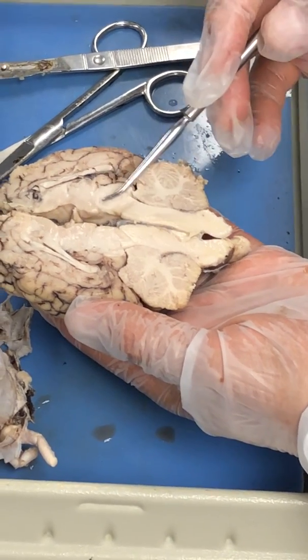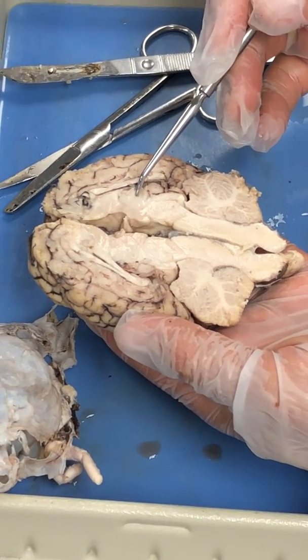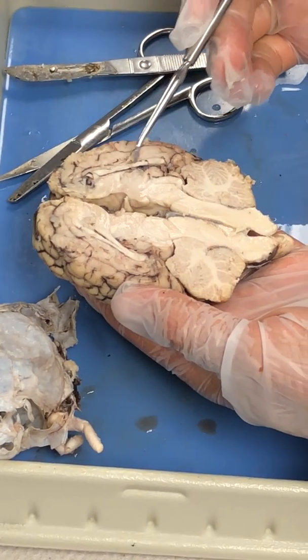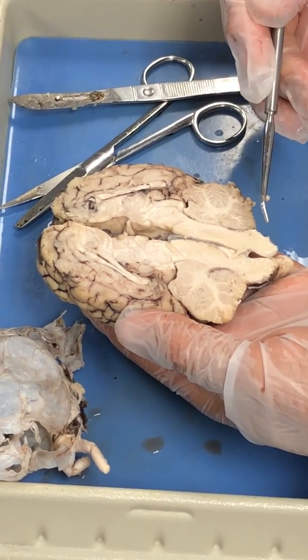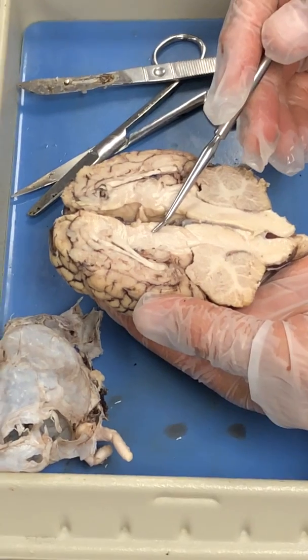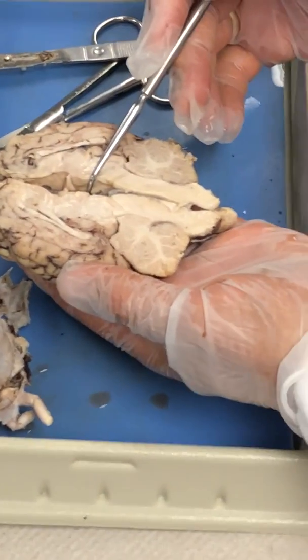This actually didn't come out very good. You're supposed to see that little round area that we call the intermediate mass, just like the picture. Maybe when you do the sheep brain, you get a better sample that will look a little bit more clear than that. That's your hypothalamus in here. The pituitary gland was underneath it when we took it out.